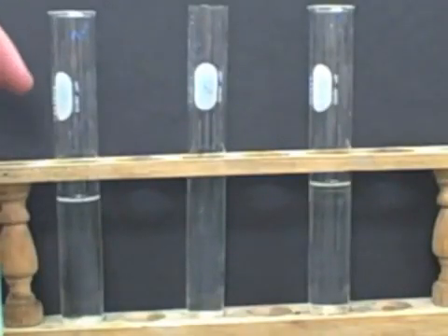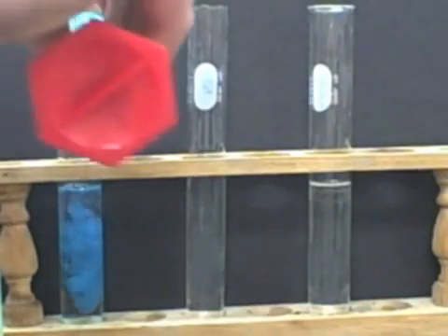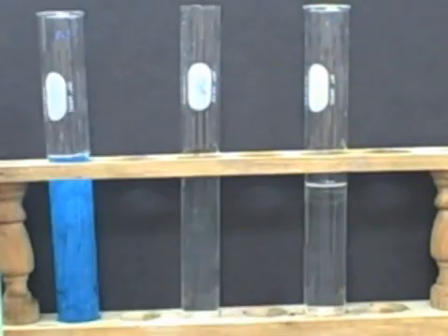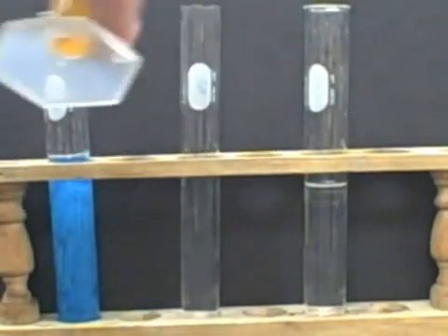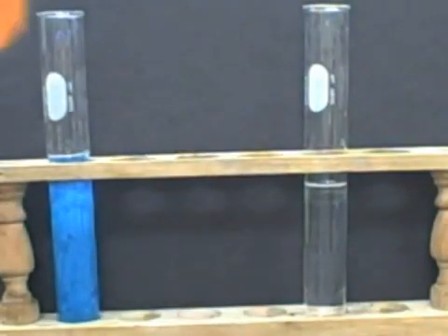So this one here, we've got sodium hydroxide, and we're going to add copper sulfate to that. Oh, you can see a beautiful light blue precipitate there. Oh, that's nice. And then this one we're going to add iron 3 chloride, this should make iron hydroxide. Wow. You can see your iron 3 hydroxide there. Nice suspension of particles.